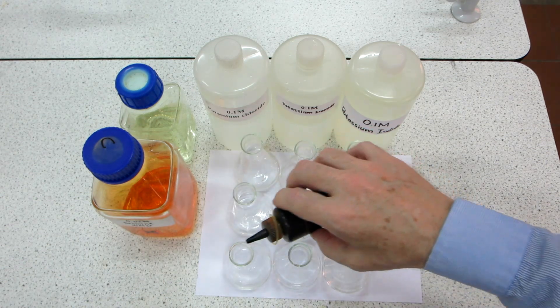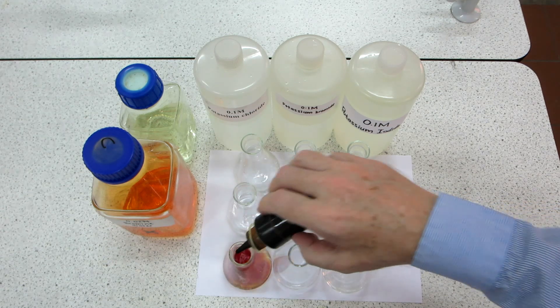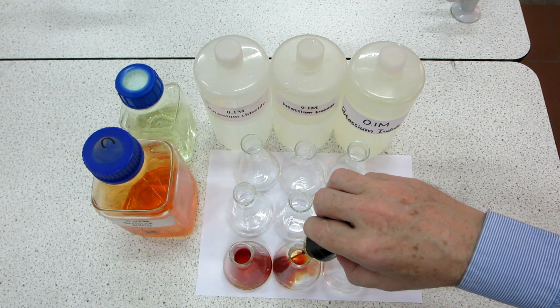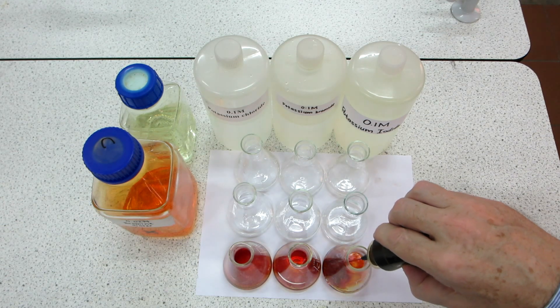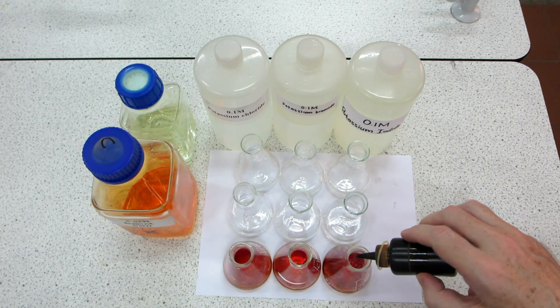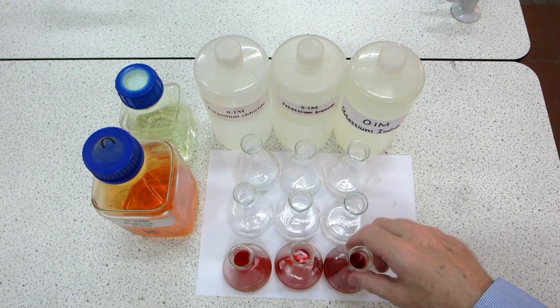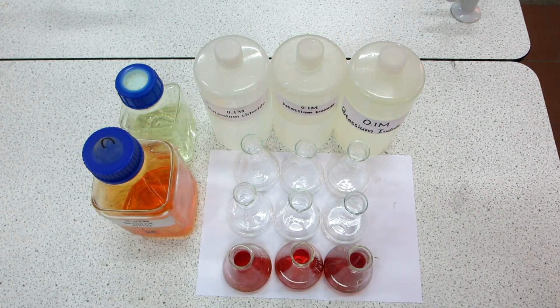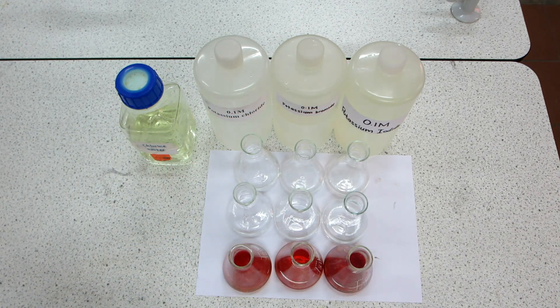Here's the iodine — you can see it stains the bottle a deep brown color, as we're familiar with iodine. We place an approximately equal amount, a few mils, into each of those solutions. We see not much difference in the three — the same color for the iodine — and nothing appears to have happened.